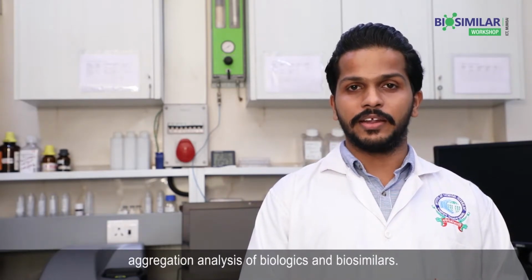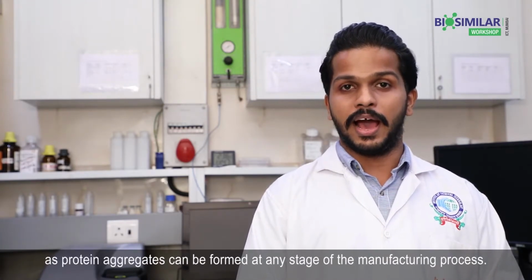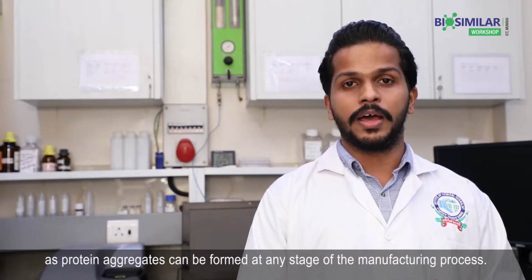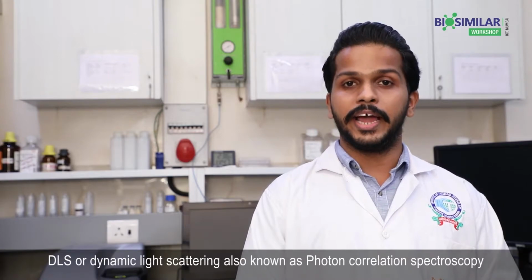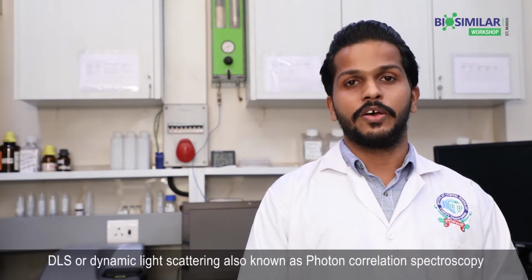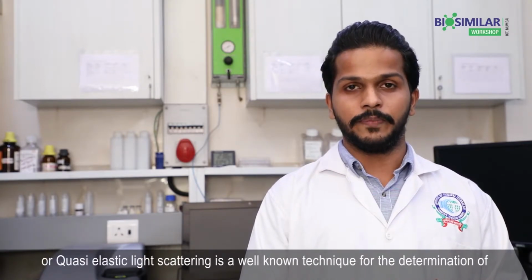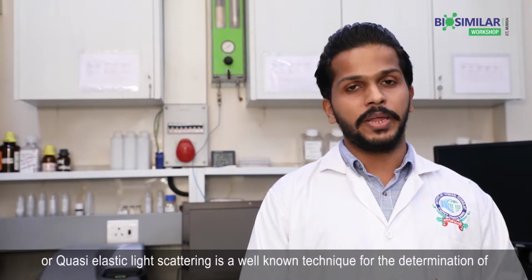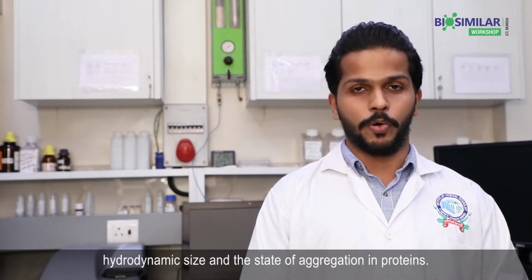Hello everyone, let us look at DLS based aggregation analysis of biologics and biosimilars. Protein aggregation characterization is a key to successful biopharmaceutical development, as protein aggregates can be formed at any stage of the manufacturing process. DLS, or dynamic light scattering, also known as photon correlation spectroscopy or quasi-elastic light scattering, is a well-known technique for the determination of hydrodynamic size and the state of aggregation in proteins.